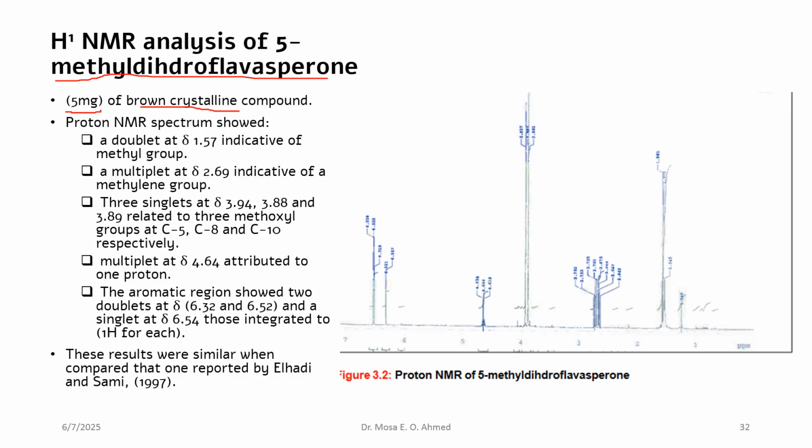Or, when compared to literature, it is an old compound just rediscovered or re-isolated. So in both cases, we use carbon NMR to determine or elucidate the structure of the compound.